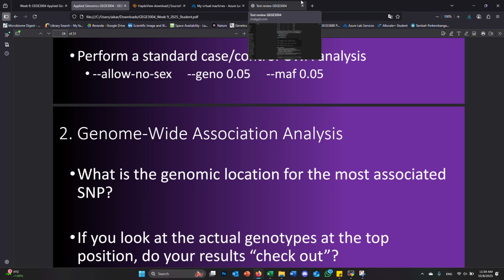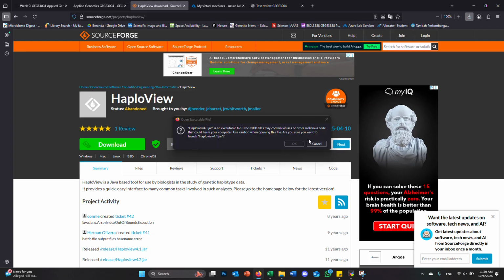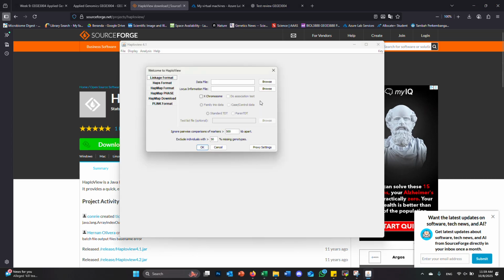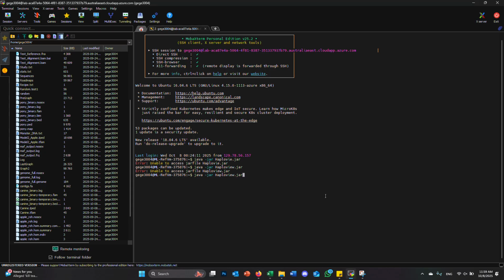So we will look at HaploView again this afternoon. I would encourage those of you who have Macs where HaploView is not working, at least one at every table, to log into your virtual machines using the PCs on the desk, and then you can use HaploView from there. Keep in mind, it's a virtual machine, so even though it's not your computer, all your files are still on your virtual machine, even if you're using the desktop for class.